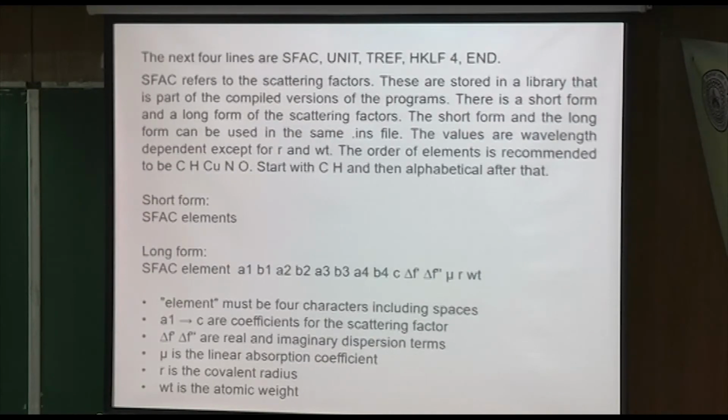OK. So the next few lines, SFAC, unit, tref, HKLF 4, and end. OK, we already discussed that. But I wanted to just mention that this SFAC, you can also put it in the long form, and you can mix the short form and the long form if you want to. One advantage to using the long form, sometimes it's hard to find it, but if you can get it, it has an R in it.